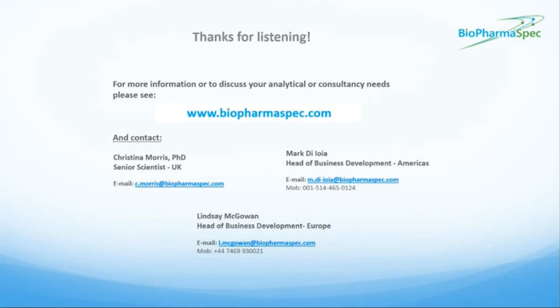So the FDA more recently indicated in a report that the likely range of HCPs should be between 1 to 100 ppm, and some biotech companies are using that as a guideline.